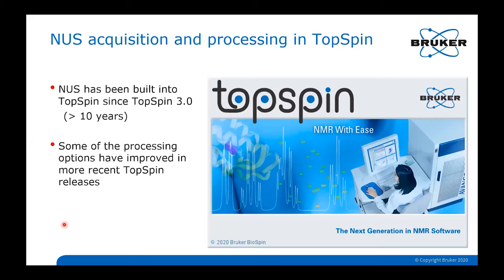And I apologize to Magritek and other benchtop instruments. I'm not personally aware of whether or not those instruments or that software are set up for non-uniform sampling. So anyhow, with TopSpin, acquisition and processing for NUS has been built into it since TopSpin version 3.0, which goes back more than 10 years. The processing, though, there have been continued advances within the TopSpin software, more processing options, improved processing algorithms in the more recent TopSpin releases.